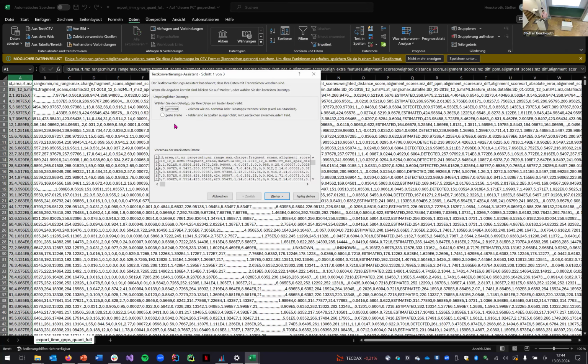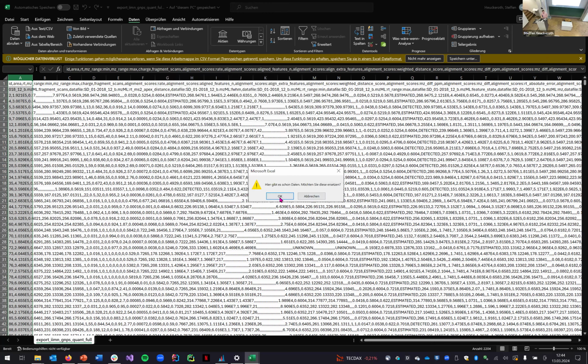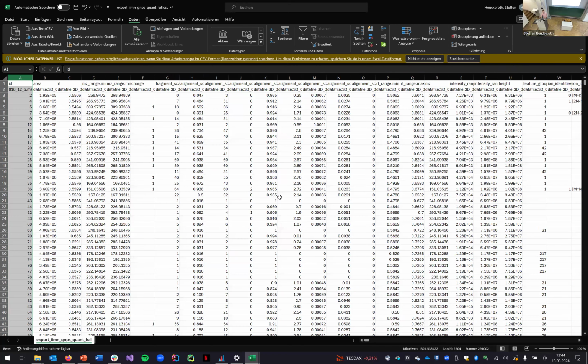And I think to answer your question, it's not done in MZmine currently before the export. You can do it downstream, but it's a good point, and we should add that to the workflow, at least to the export, to just export the most intense or representative feature, so we don't have to deal with that problem, or you don't have to deal with that problem later on, because it should be easy for us to do that. But thank you for the input.